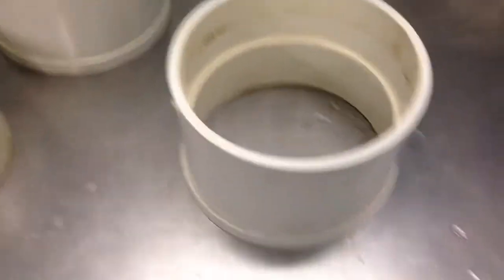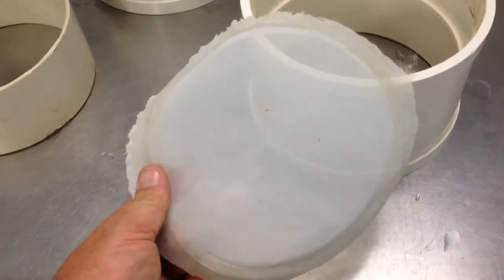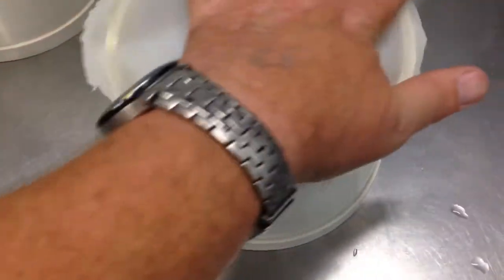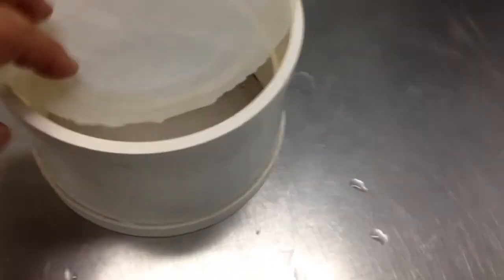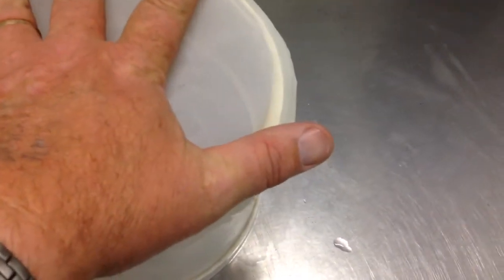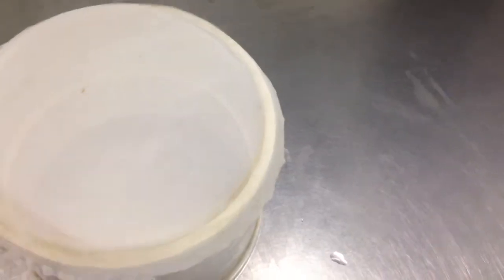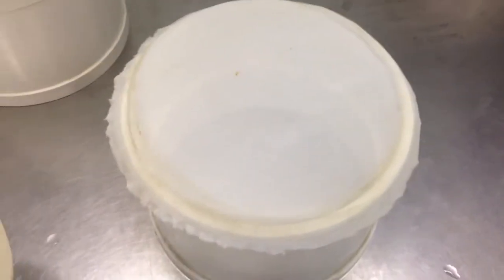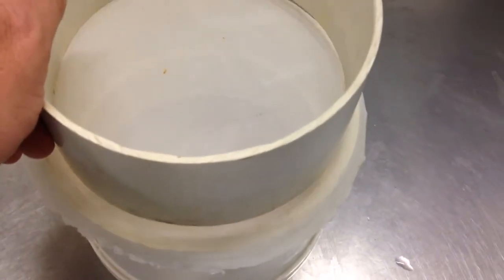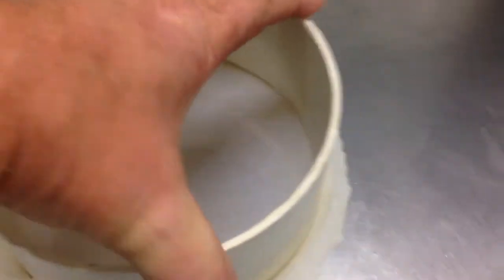You need that amount of slack because what you want to do is to take your filter material and wedge it in between. So what you do is you cut a square of filter material — in this case I'm actually using one that I've already used. You cut a square of material, place it over your coupling, put your piece of pipe onto it, and then push it in like that.